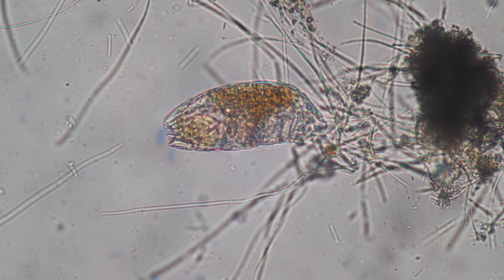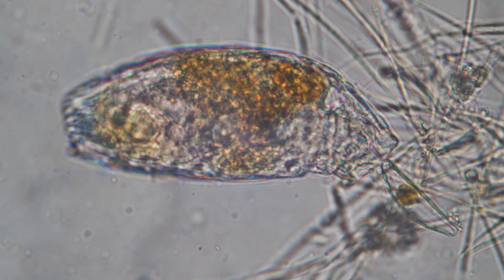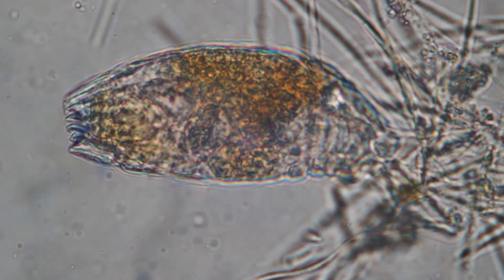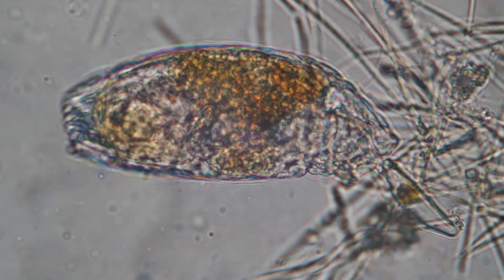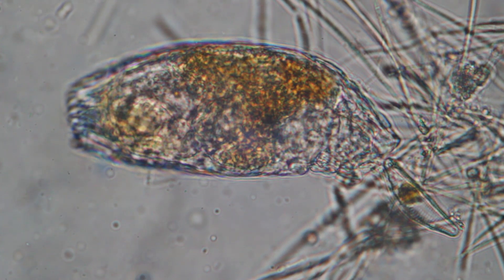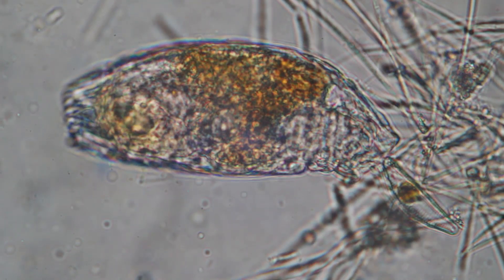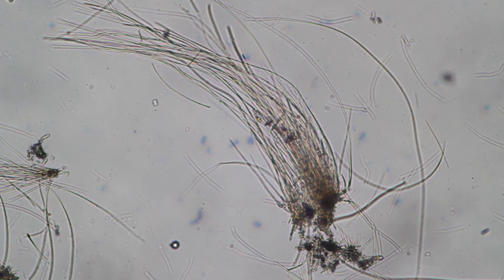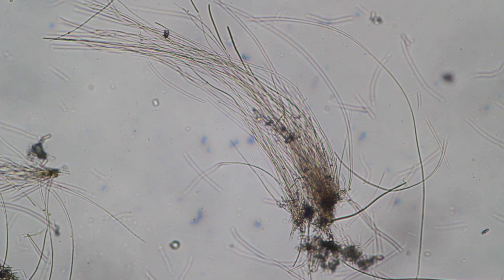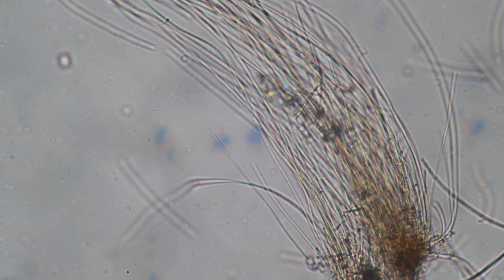Something interesting here: the little structures you can see inside the rotifer normally look green, because when rotifers eat cells and algae the color of that food makes them appear green. In this case they look more reddish, because I suppose the material they have eaten is more red — the iron oxide, I suppose, though that is speculation. There are also some bundles of what I would say are probably bacteria or other algae; they're quite fine so they could even be prokaryotes growing like this.